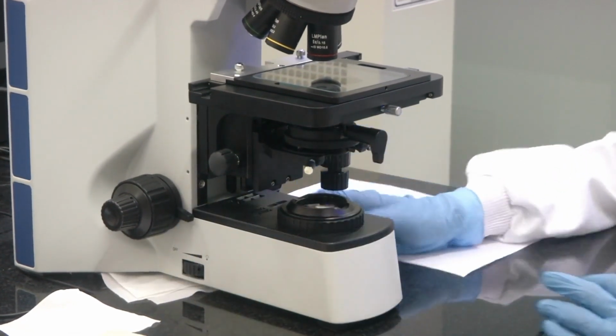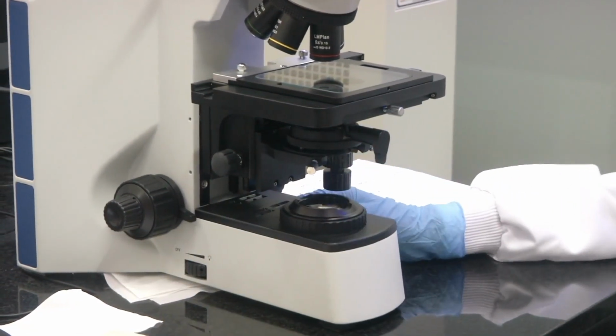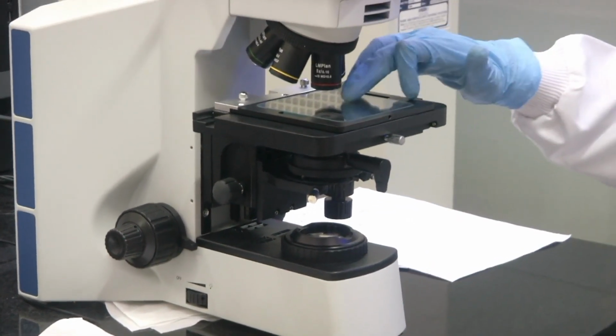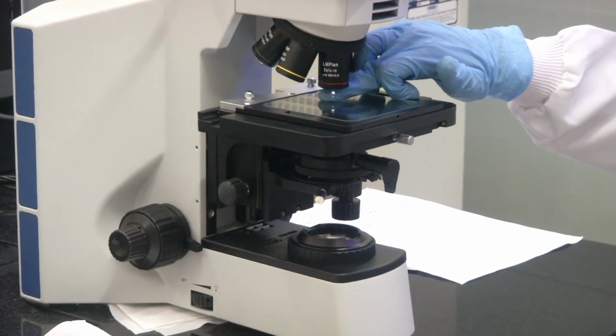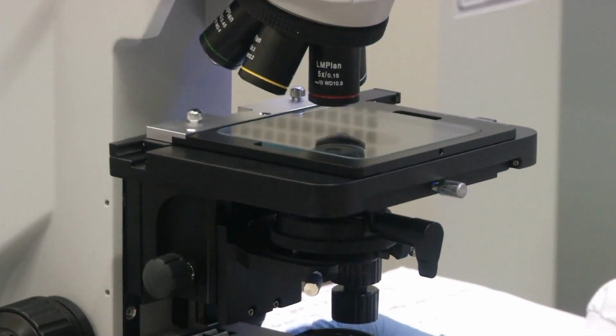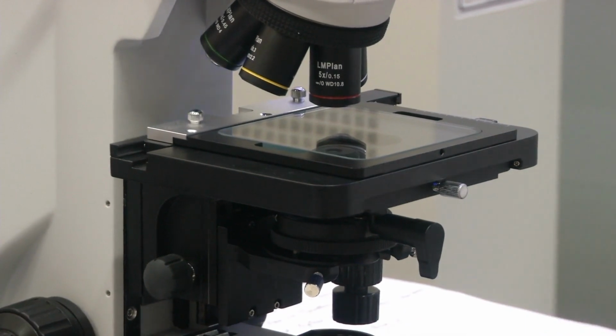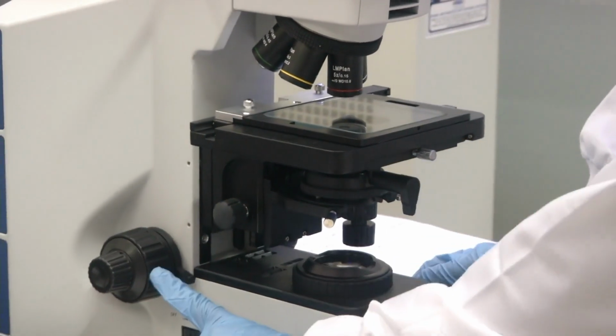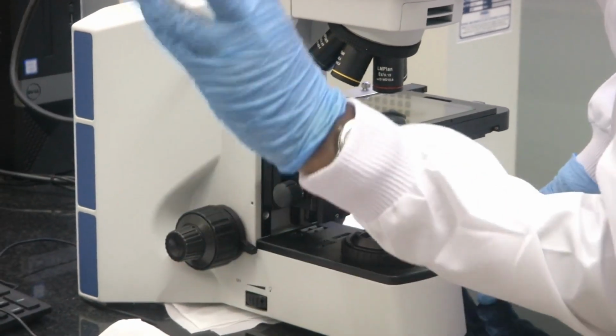Switched off. Similarly, on the other side, you might not be able to see, there is another knob with which you switch on the top illumination. So I have switched on the top illumination. See my gloves, and the top illumination is on. Now, just like in the stereo microscope, we have two knobs here. These two knobs, you can see, just follow my gloves.